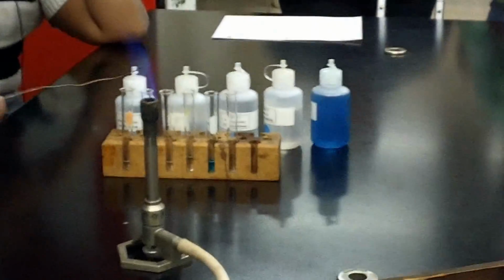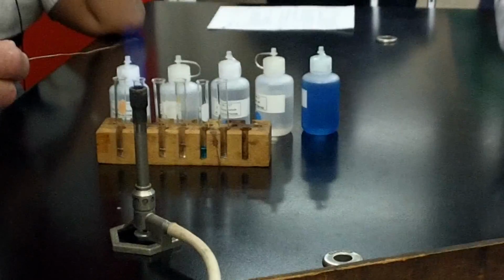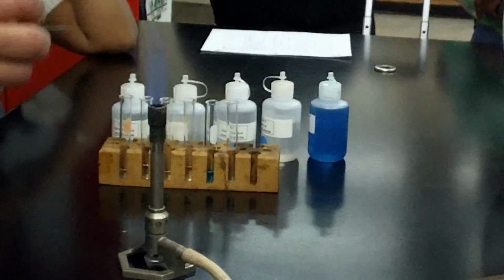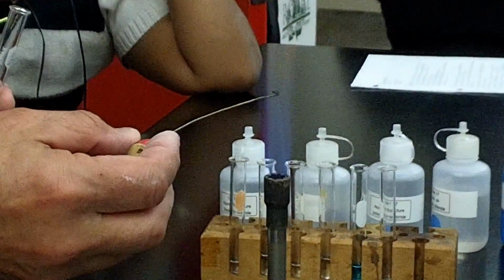So this is hydrochloric acid. You heat this up. The flame doesn't have to be crazy hot. And while it is hot, see it's still glowing hot, put it in here. And you'll hear it go sizzle. All right, and you see the color, it's not as intense as it was, sort of clean.